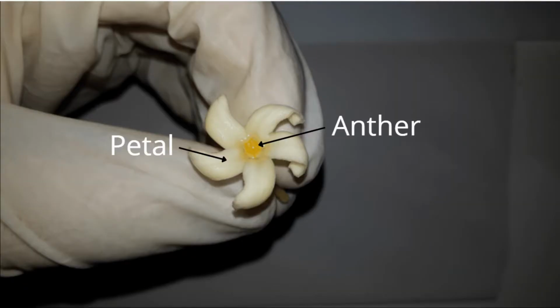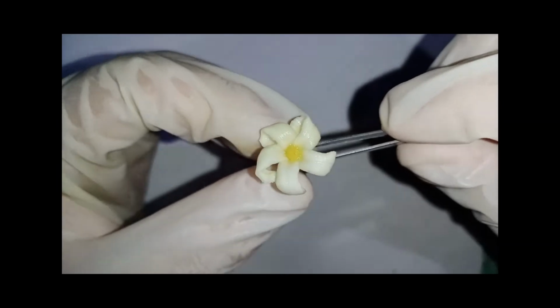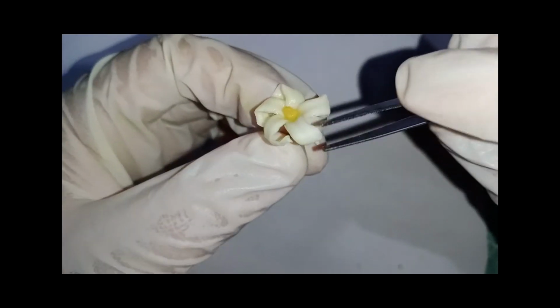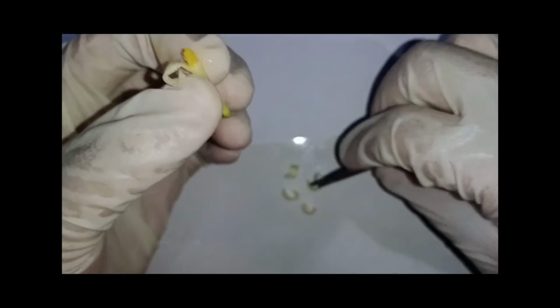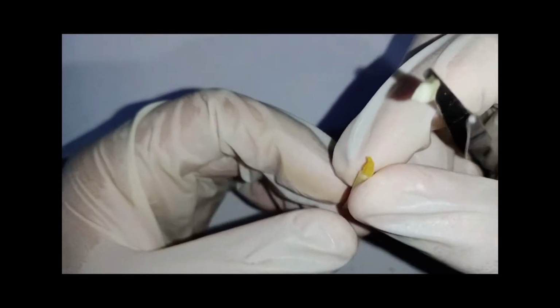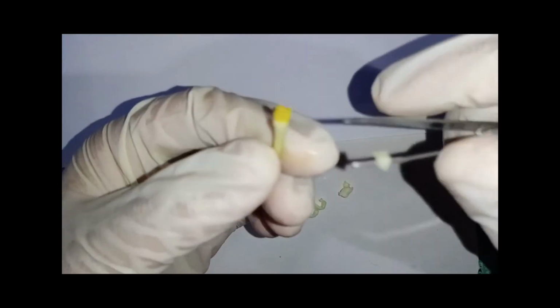Okay, so after this we will dissect: we will pull out the petals and put them in the column. So this is the overview when we pull out the petals from the male flower.